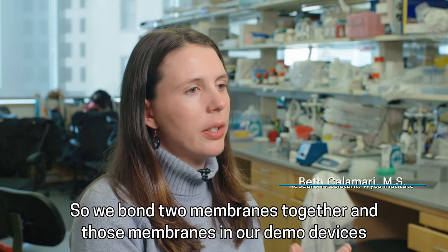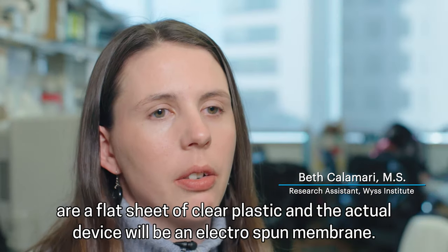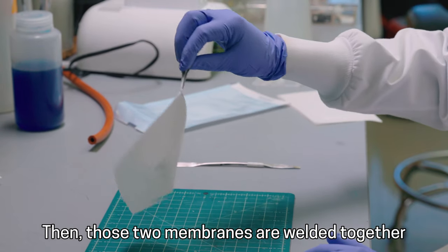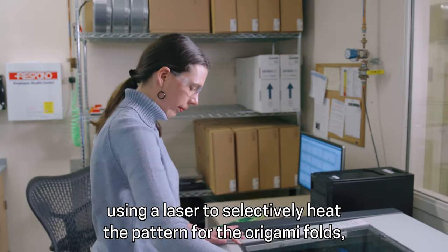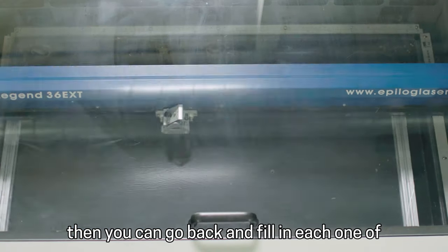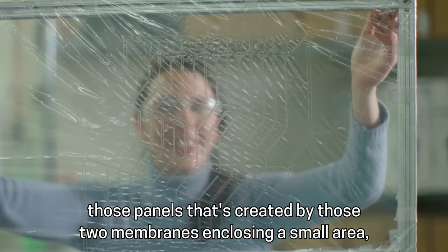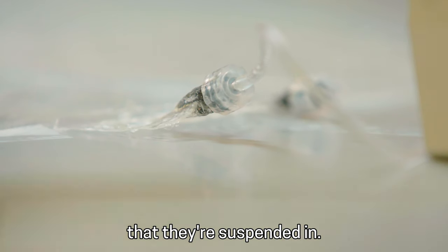We bond two membranes together — in our demo devices, a flat sheet of clear plastic — and the actual device will be an electrospun membrane. Those two membranes are welded together using a laser to selectively heat the pattern for the origami folds. Then you can fill each one of those panels created by the two membranes enclosing a small area, and that's what you would fill with your cells in some kind of matrix that they're suspended in.